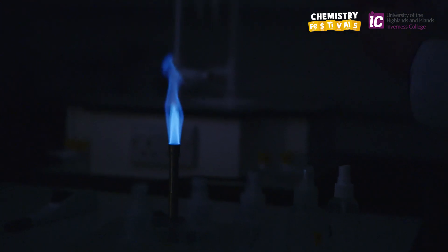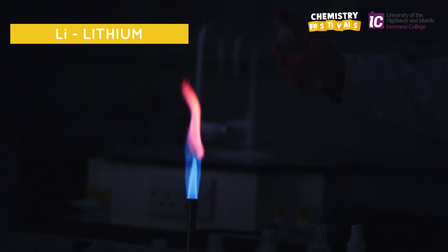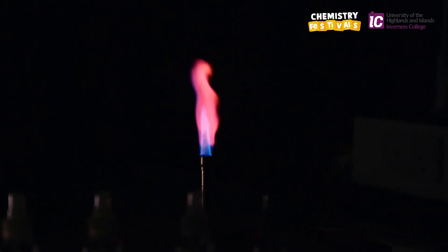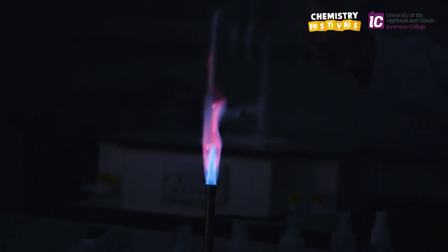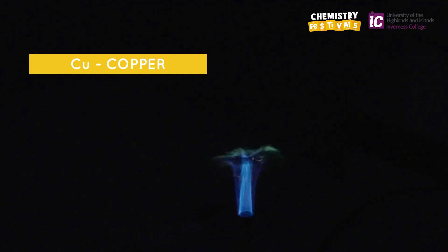I'm spraying a solution of metal A, lithium, into the flame. It produces a beautiful crimson colour. I'm spraying metal B, which is copper, into the flame. It produces a bright blue-green colour.